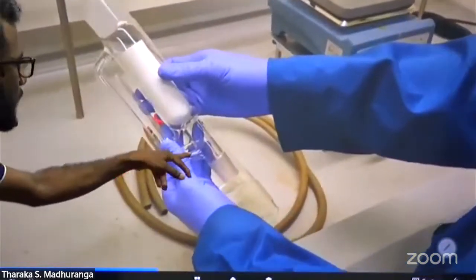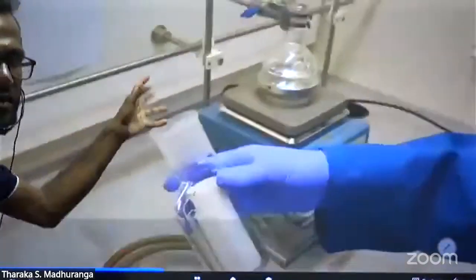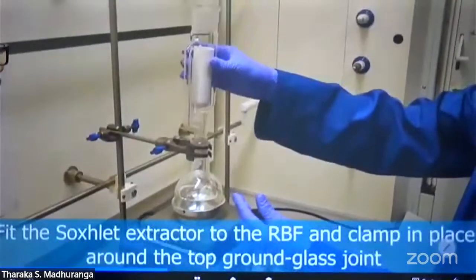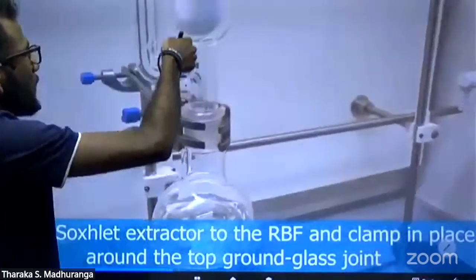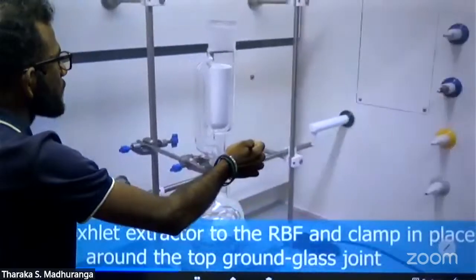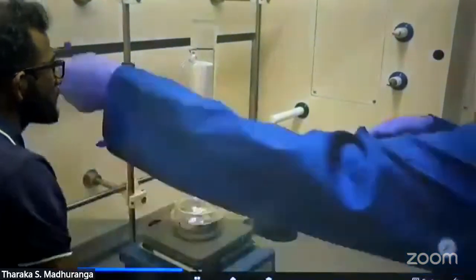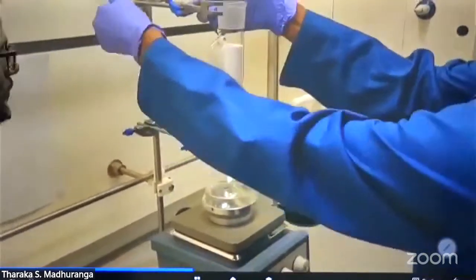That's the vapor transferring tube, the second part of the system. You can't see the siphon tube. I will show you.